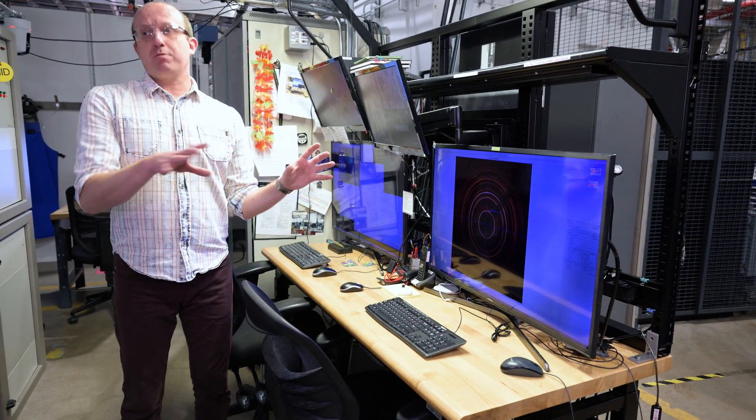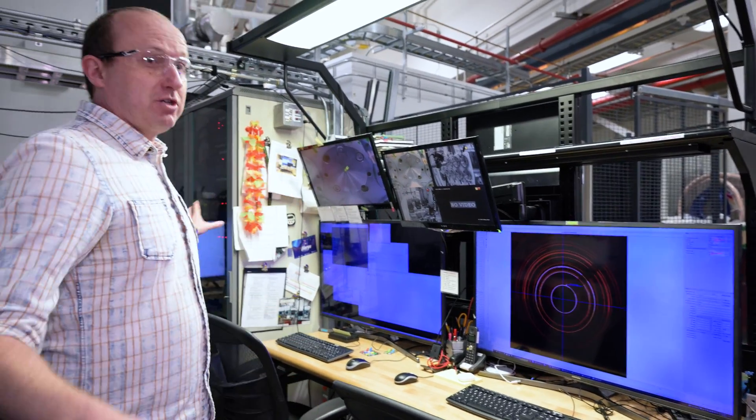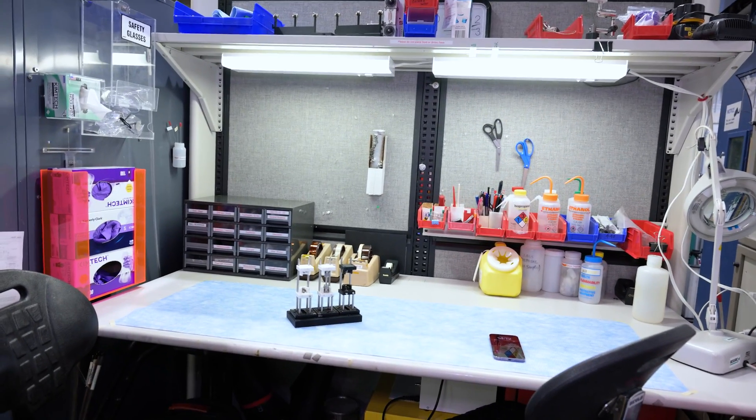What you see here is a fingerprint of a material. I mentioned that we have three stations around this beamline. The sample prep station over there, where scientists very often prepare the samples and experiments.